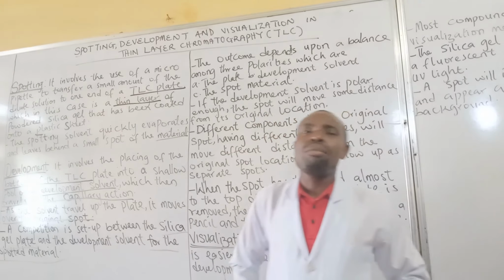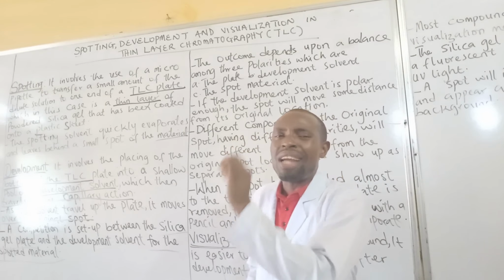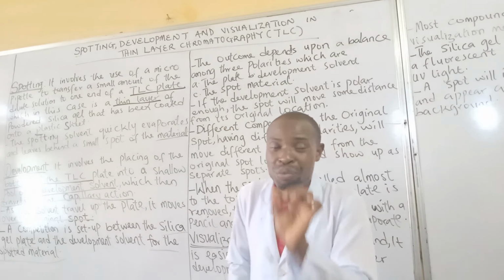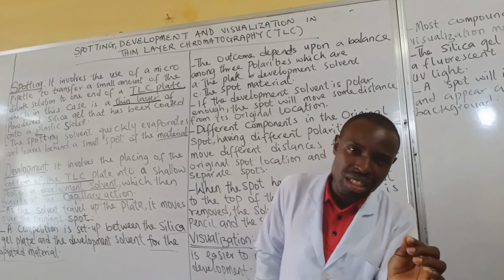Now, we should understand that before these steps are carried out, the sample to be analyzed is first of all dissolved in a volatile solvent.